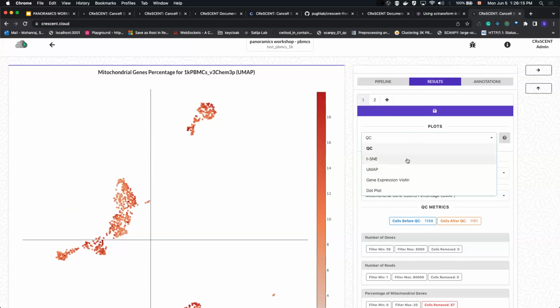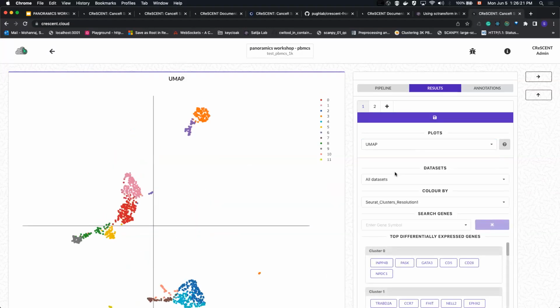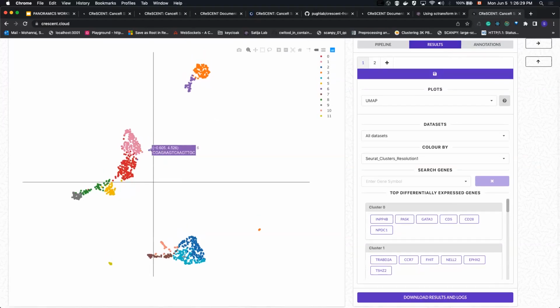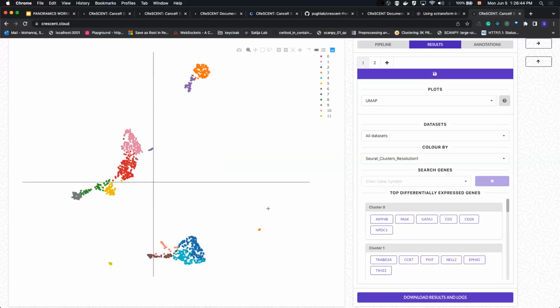There's also our actual exploration and gene expression itself. So tSNE, nowadays we're using UMAP. The difference is that the distance in UMAP is actually a measurement, so the distance matters here, whereas in tSNE, it does not matter. Both are equally effective at showing clusters and summarizing high dimensional data into a visualization, but the default nowadays is UMAP.